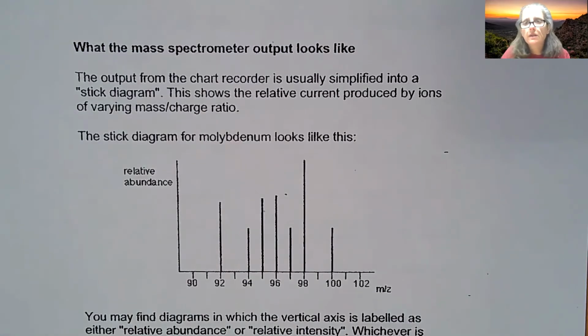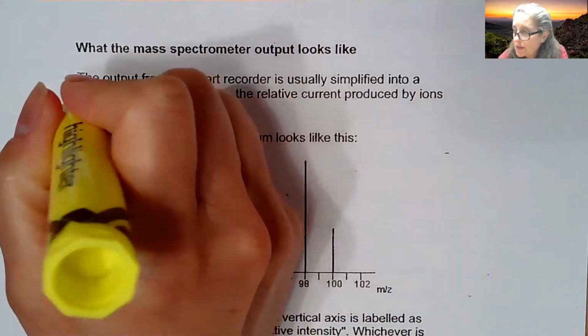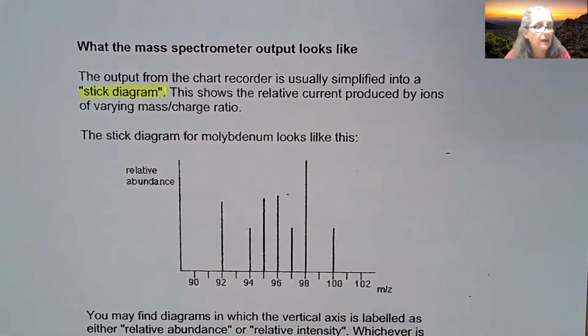So this video is focusing just on mass spec and just the basics of what you would probably see in terms of a problem on the AP test or on my test. So I'm not going to go into how the mass spectrometer works. I just want to focus on what's the output, or what's the spectra that you see. For this, you might want to have some kind of highlighter with you so you could highlight the important things that you need to take a look at.